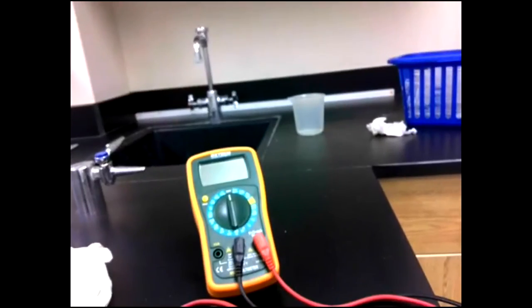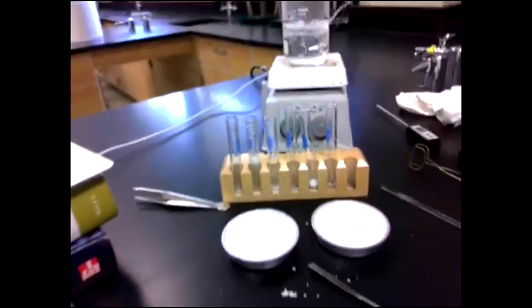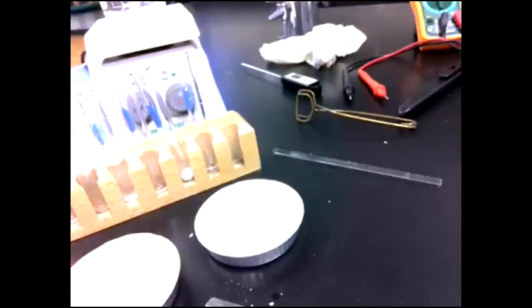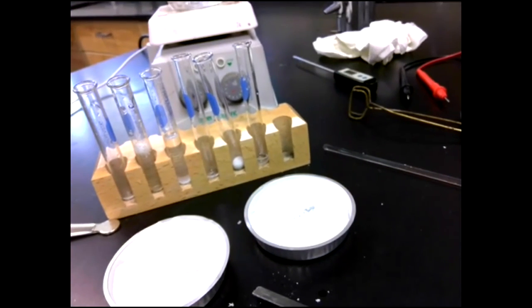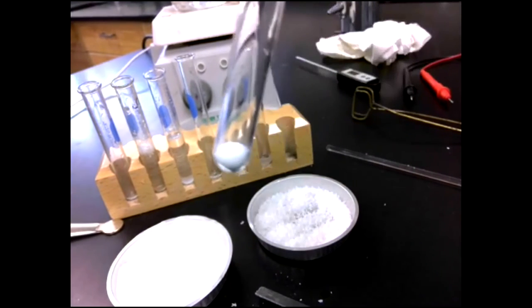We're done. Any questions about anything while I have this on? Anyone want to see anything again? Let's see. So we have the solubility, we have the crystals, what they look like, and then the conductivity and the melting. So we covered everything. Wait, what was the melting point for solid A? Well, A, it never melted. So we don't know its actual temperature. We just know that it's high melting.